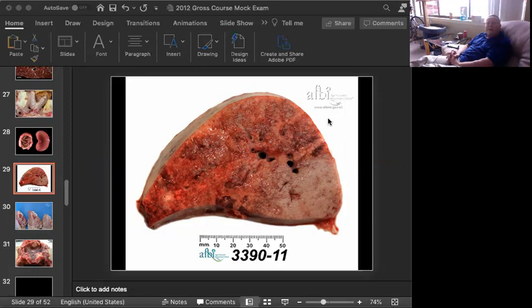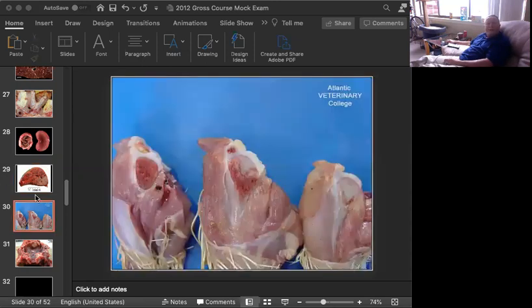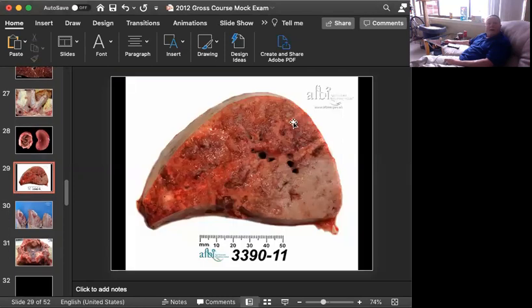And when you see one that looks like lymphoma, you see something that looks like a sort of grayish tumor, as in right here, probably going to be pulmonary adenocarcinoma. It is caused by an exogenous beta-retrovirus in sheep, and you can see that there are, to give you a preview of the next one, a lot of little areas here which have a similar appearance, but you have this large focal area. Now, if you look around at the periphery of all this, you'll see that it's dark because this often engenders a tremendous amount of edema as well, and macrophages.